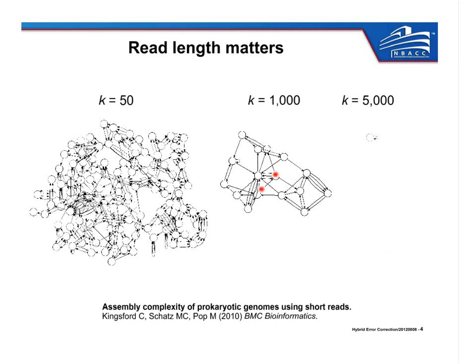With the smaller read lengths, you're not assembling everything. Each of these edges represents something that's missing. Typically that's intergenic sequence, introns, repetitive sequence, tandem repeats, all kinds of regions of structural importance in the genome. Generally the exons and the coding sequence are relatively unique, and they'll come out in full contigs. But it's the structural content that we're most interested in using these big reads for.